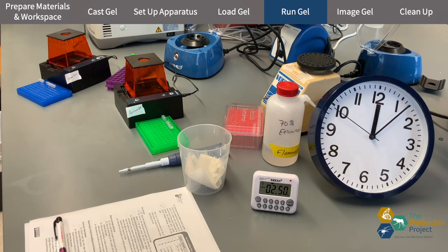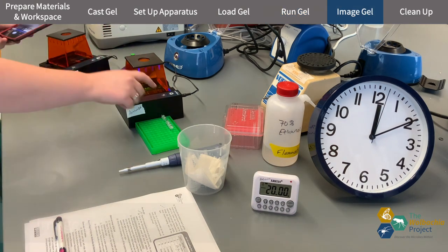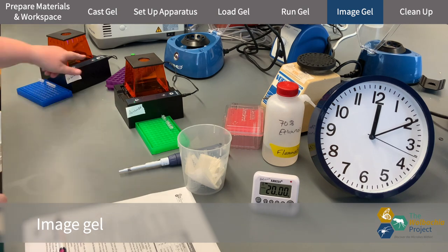After about 20 to 25 minutes, it's time to image the gel. I turn the blue light on and use my phone to take a picture through the photo hood. My results look great!